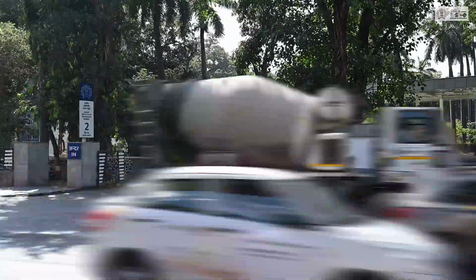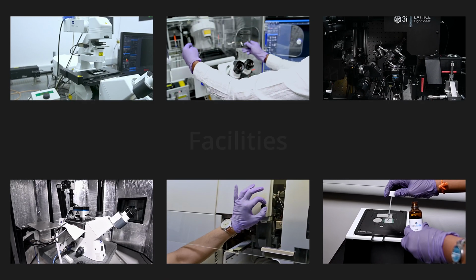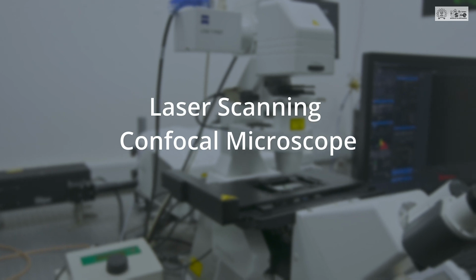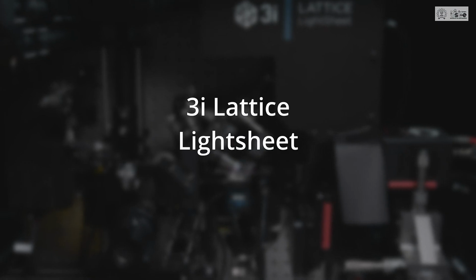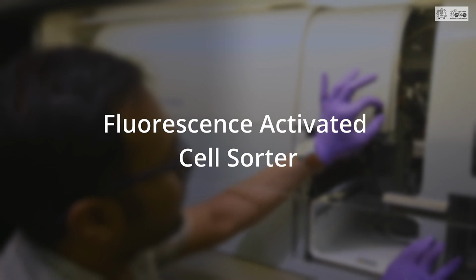The Indian Institute of Technology Bombay's Biosciences and Bioengineering, or BSBE, department is home to high-end microscopy and lithography facilities that researchers can use to image tissues, cells and organelles, measure physical and electrical properties of cells, and print micro-sized objects. The BSBE department allows affordable access to these facilities to researchers outside IIT Bombay.